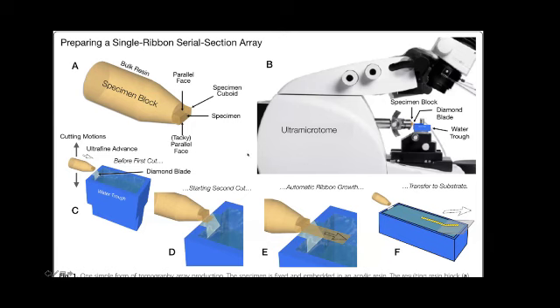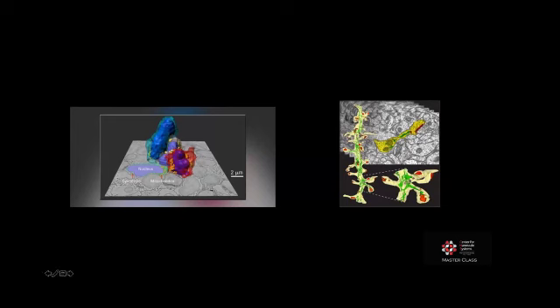And this microtome is going to allow us to do it because it is a very stable construction, so it allows for that ribbon to be cut sequentially forever. We bought this with a special knife, which allows us to insert a slide into the boat that we can then tease these ribbons onto, many of them, without losing any of them. And then we can take this to the SEM for serial imaging. All right, and again, we can ask 3-dimensional questions now, where before we were only getting 2-dimensional.